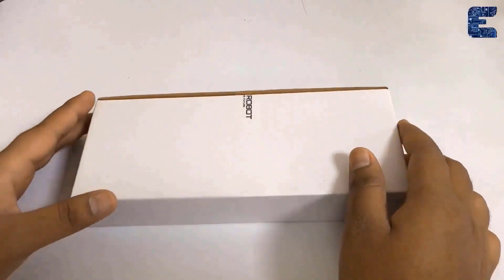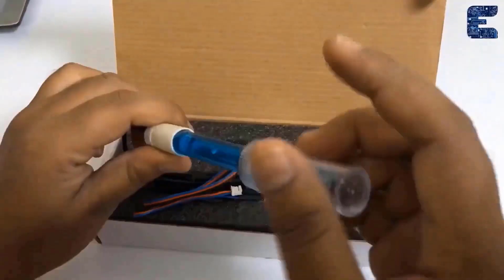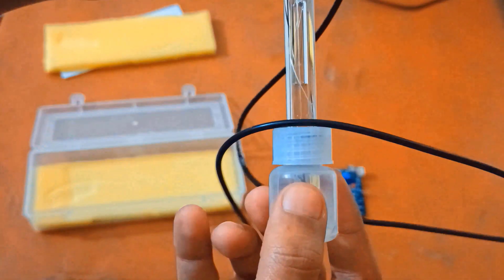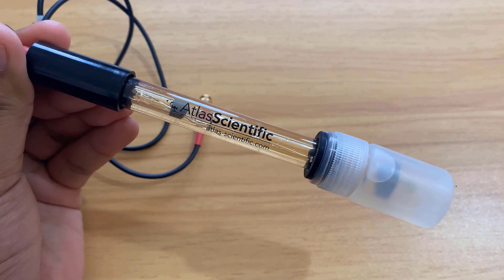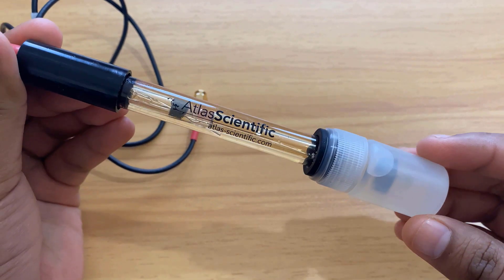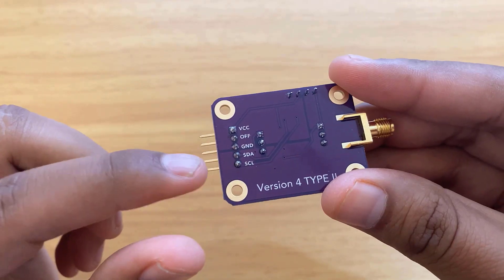Before this, I made a detailed tutorial on two different types of pH sensor — one was from DFRobot and the other from Graylogix. Compared to earlier versions of analog sensors, this is one of the most scientific and accurate pH sensors, as it has UART as well as I2C interface.